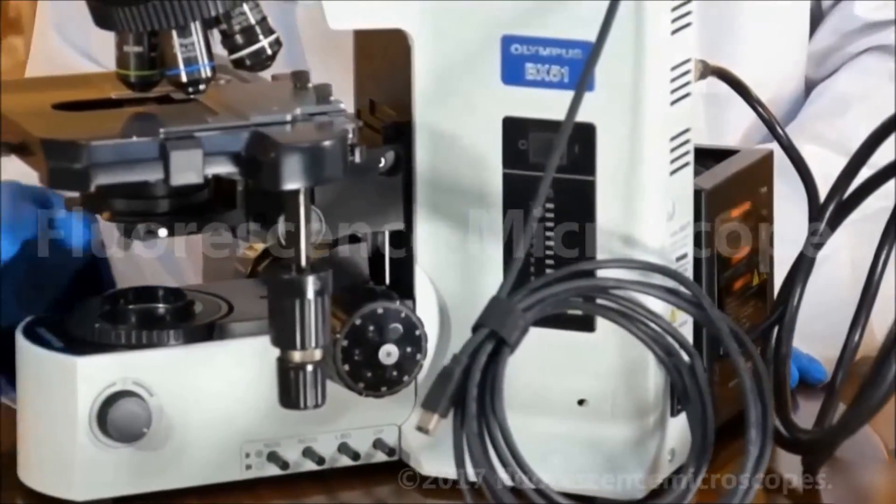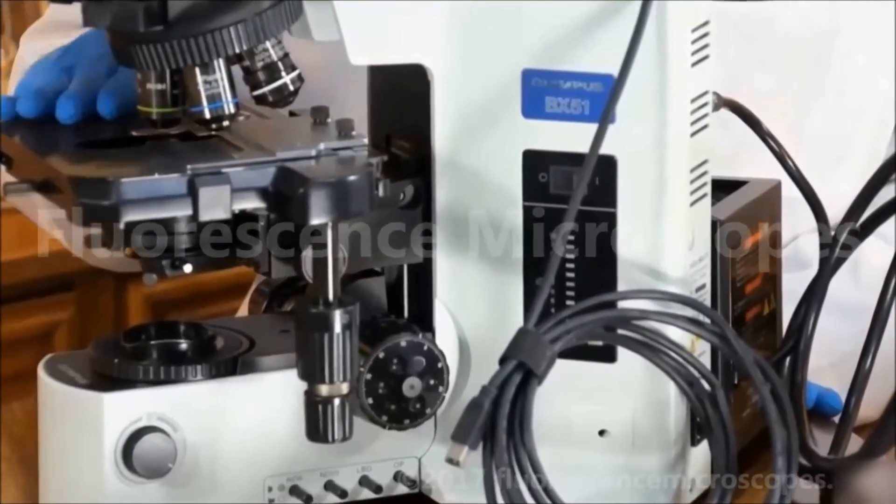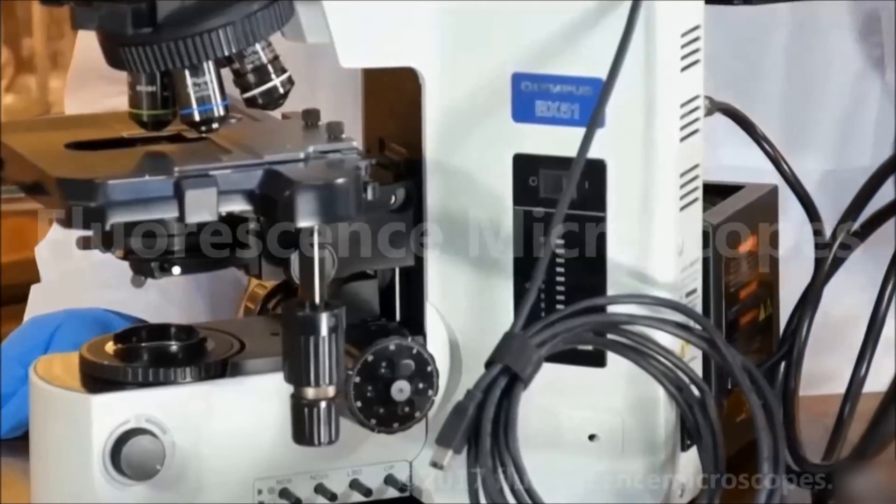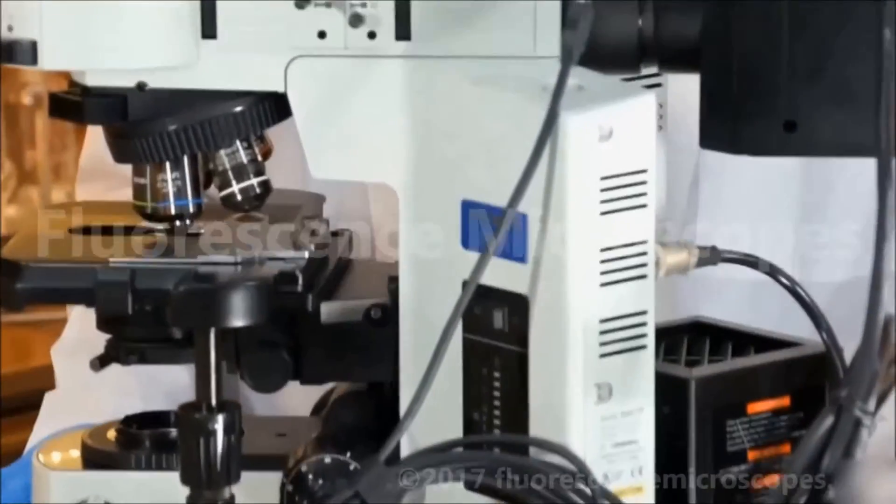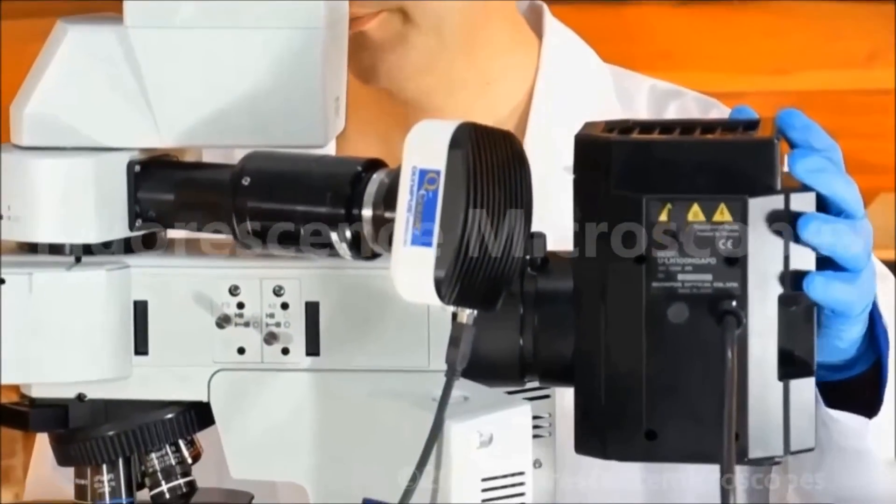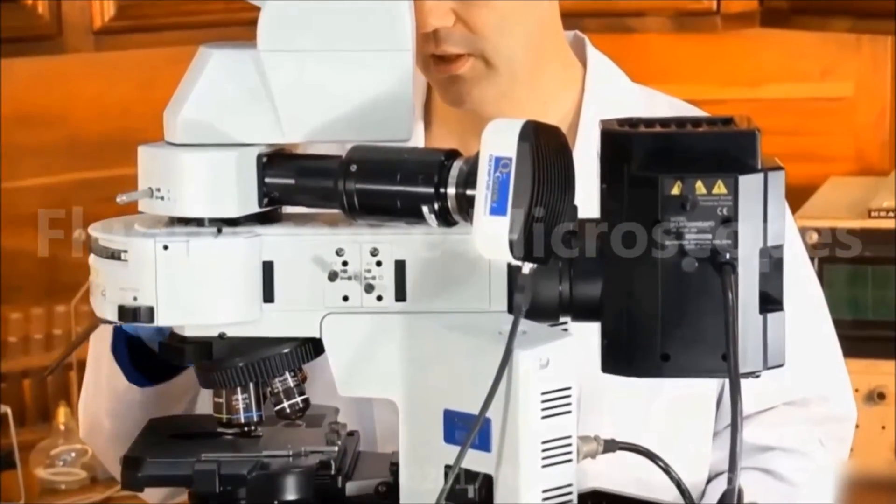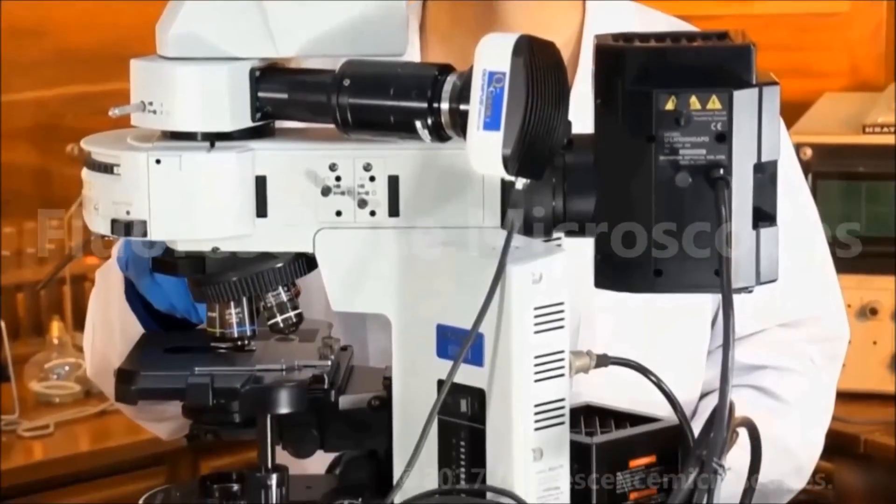That is going to shine through our lens at the bottom, transmit through the slide. Our epifluorescence illumination is from the mercury. It goes through our dichroic cubes and reflects off of the specimen.